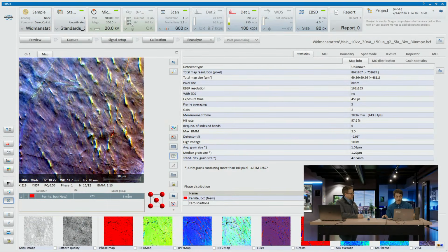Another advantage of our software is this thing called an Argus image, or now sort of a pseudo Argus image. The benefit there is that before I even run a scan, I can take a look at my sample. I'll switch over here to the software. We can look at this virtual forescatter image, and this tells me that I have regions of very high topography, some scratches here. If I saw this, before I even do a scan, I just bring in the detector, I know I probably want to take this out and do a better job of polishing.